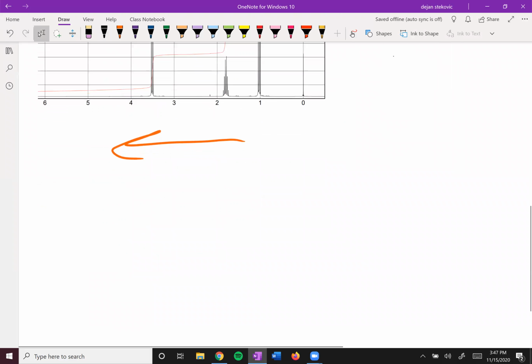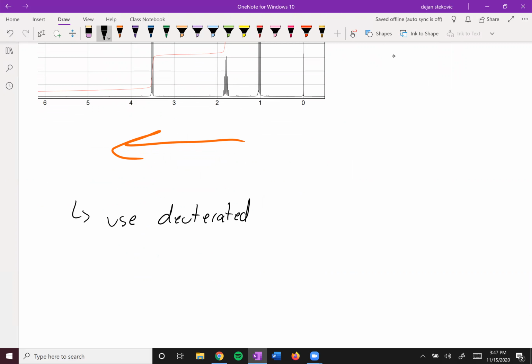In terms of doing the NMR spectra, I'll post a little video of someone prepping a sample for NMR, but it's really quick and easy. You just take a small amount of your compound of interest, and you dissolve it in what's known as deuterated solvents. Deuterated solvents mean that we have deuterium, which is H2, instead of H. Instead of just having 1 proton, it has 1 proton and 1 neutron. And so basically what this does is shift the location of the D peak, so that we don't see any peak from our solvent, or if we do see a peak from our solvent, it's very tiny.